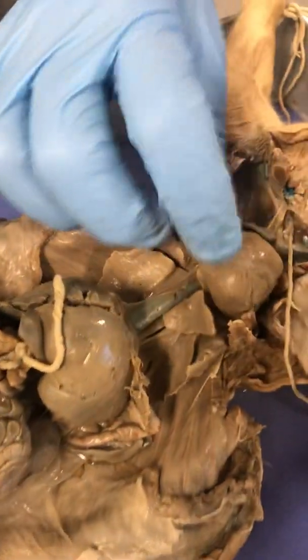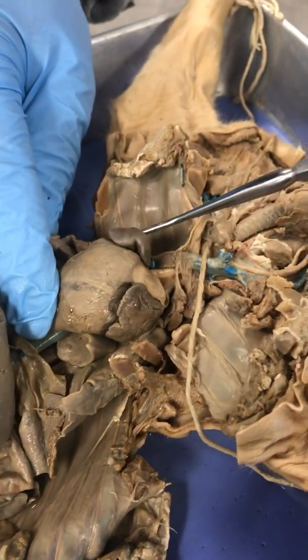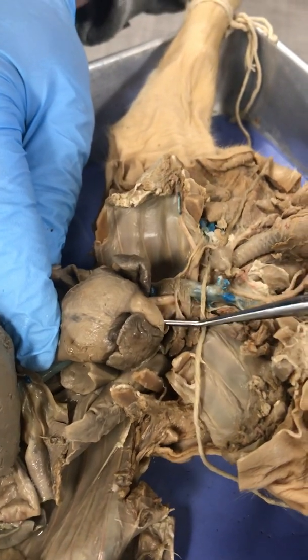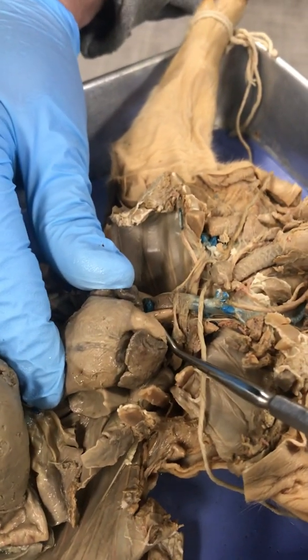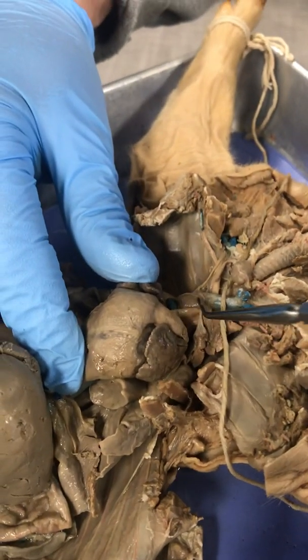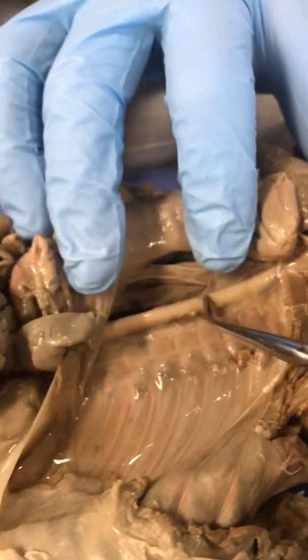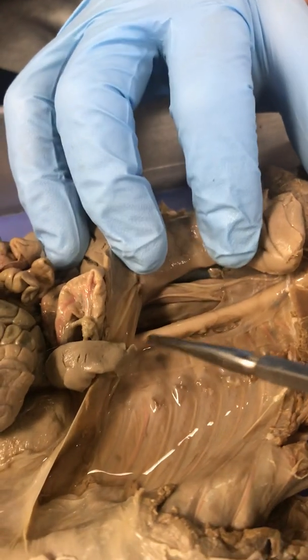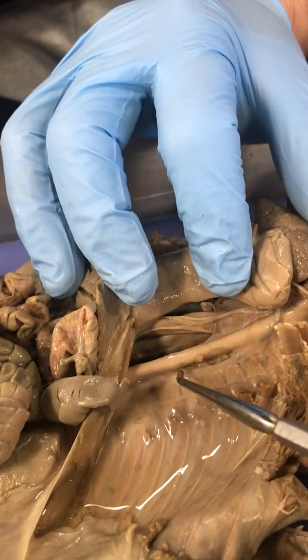Okay, the heart itself, you can see right here the two upper chambers, which are the atria, right and left. In between those would be the pulmonary trunk, and then directly posterior to it would be the aorta. And again, remember that aorta turns and goes downward, and you can see the extension of that downward projection. Since it's in the thoracic region, we would call that the thoracic aorta. Now, there is a vessel that would come right alongside of it. It's a vein, and that's called the azygous vein.